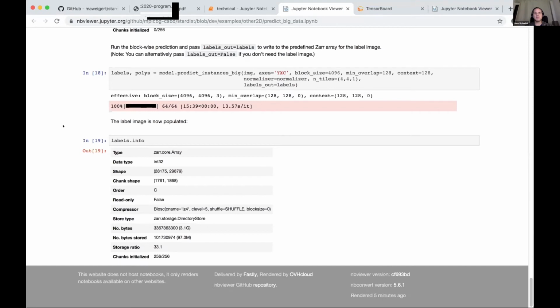I've tried it once to fine-tune a network, and what's the best way of doing this is a bit of an open question, right? This has to be tried, and so far it's just something we haven't done yet. But it would be interesting to see which of the different ways of fine-tuning works best. I would also like to know that, like which layers to freeze in the beginning and so on. This is something to be tried, and it would be nice if somebody tries.